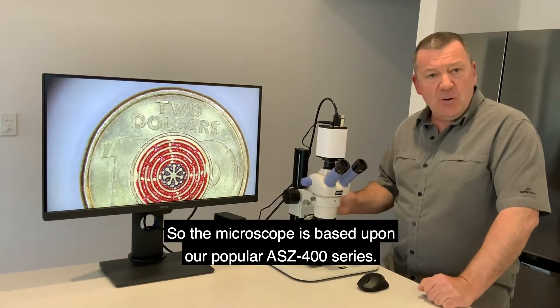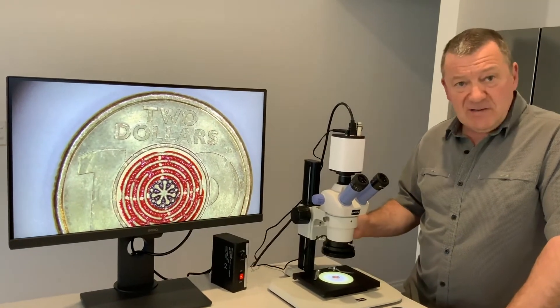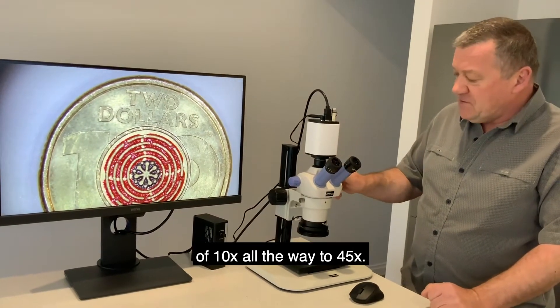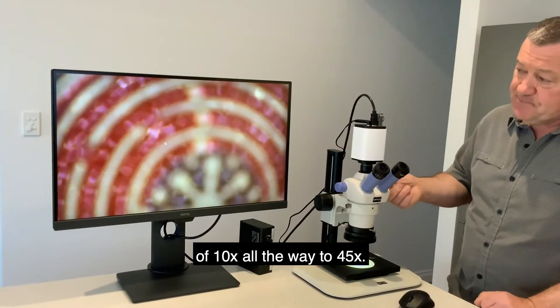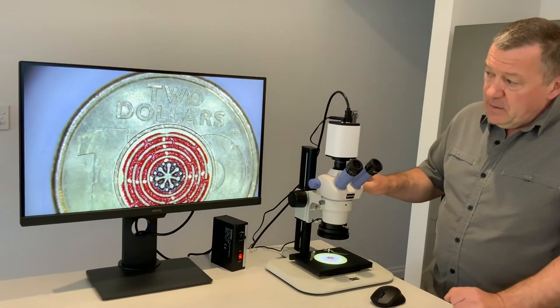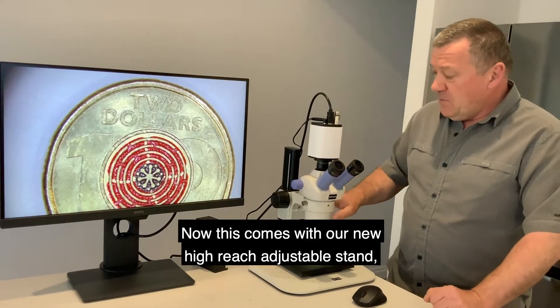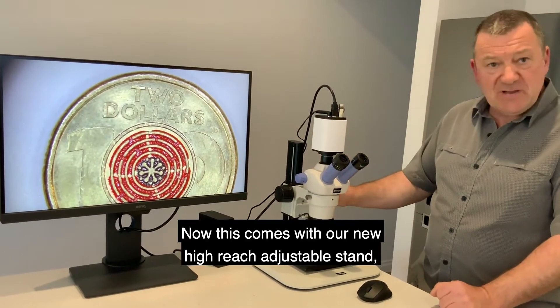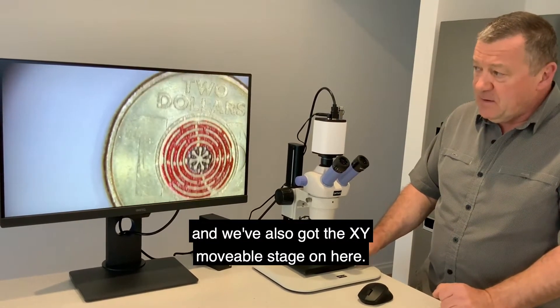The microscope is based upon our popular ASZ 400 series, so it's got a stereo zooming magnification power of 10 times all the way to 45 times. It's got the trinocular head so it can fit the digital camera. This comes with our new high-reach adjustable stand and we've also got the XYZ movable stage.